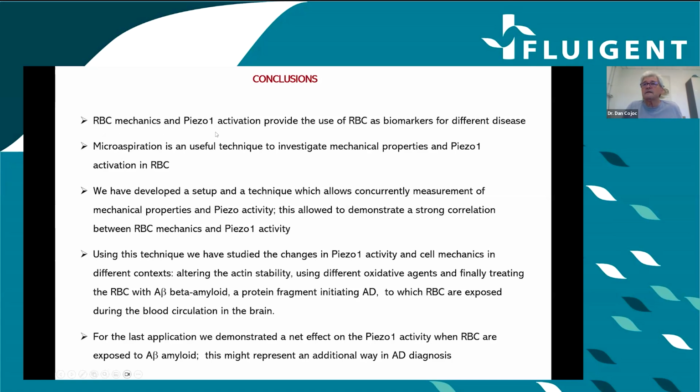Red blood cell mechanics and Piezo1 activation provide the use of red blood cells as biomarkers for different diseases. So it's an interesting point because experiments with red blood cells are mechanical and not only mechanical, they are relatively easy and accessible.